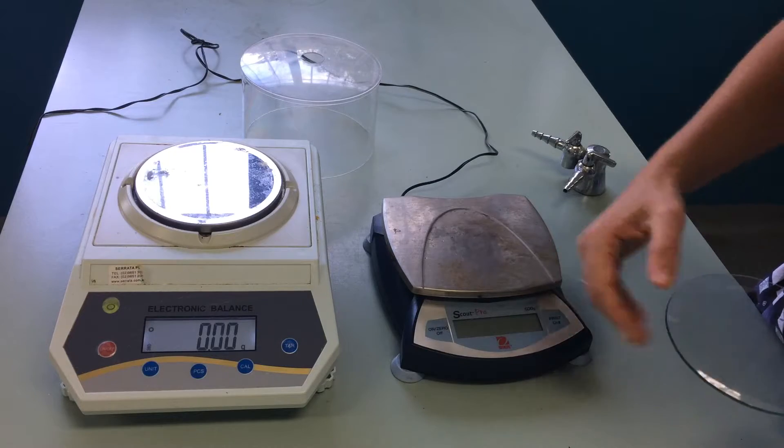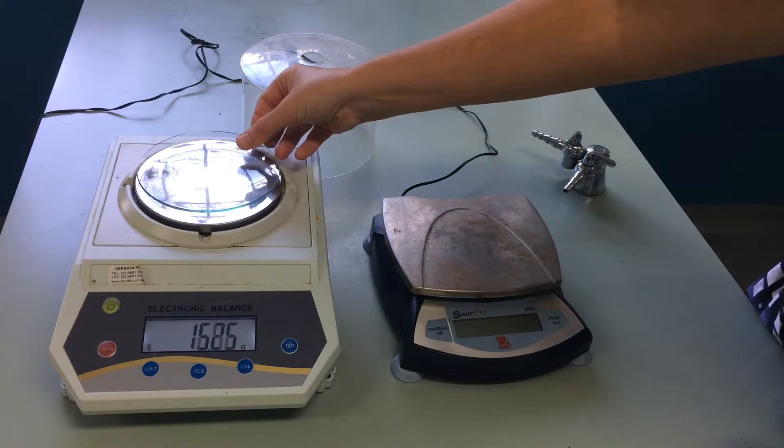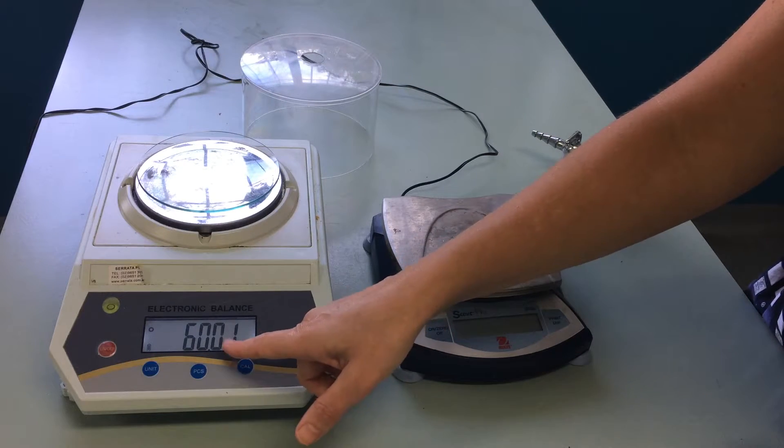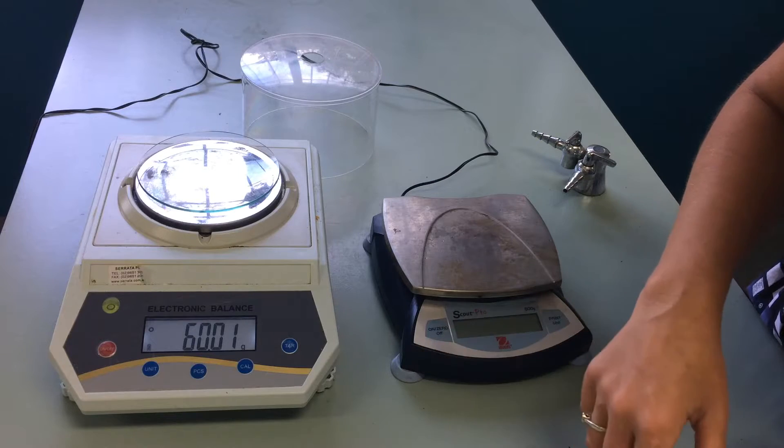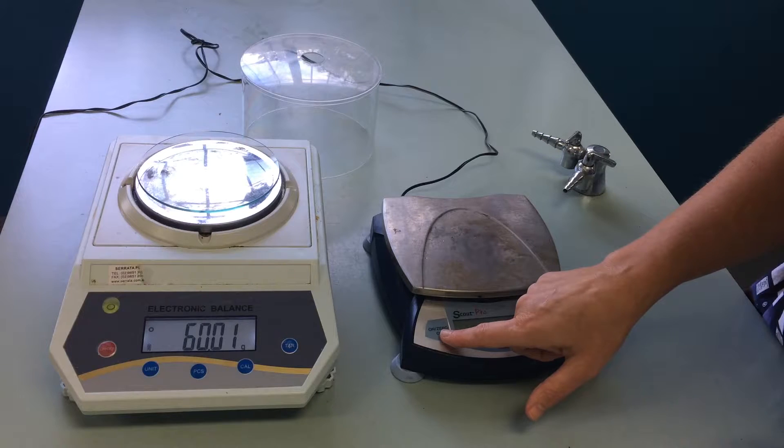It's best to always use a container that protects the balance pan's surface. Place your container on there. Now you'll notice it's reading the mass of the container. We need to cancel that out by pushing the tare button, sometimes called the zero button.